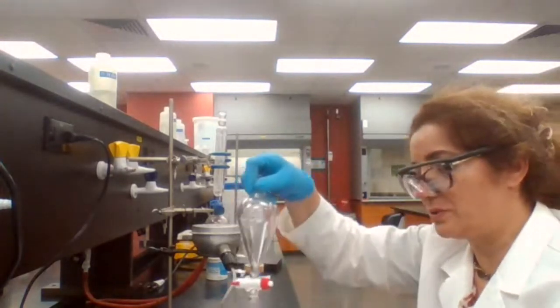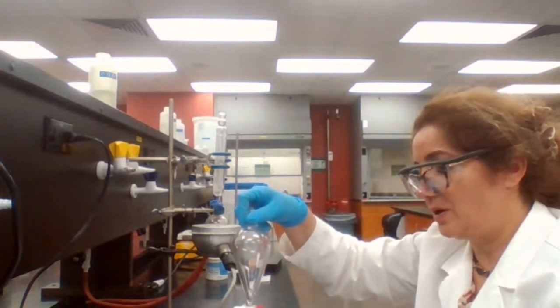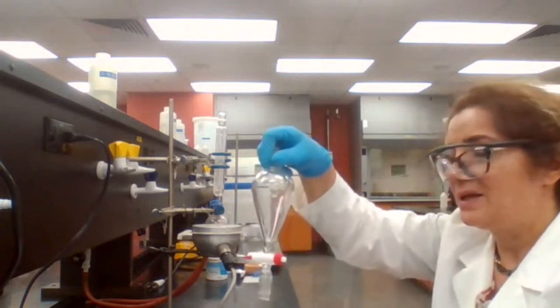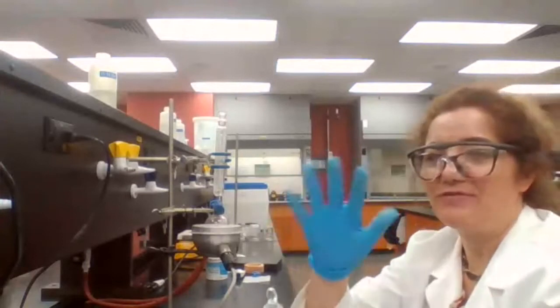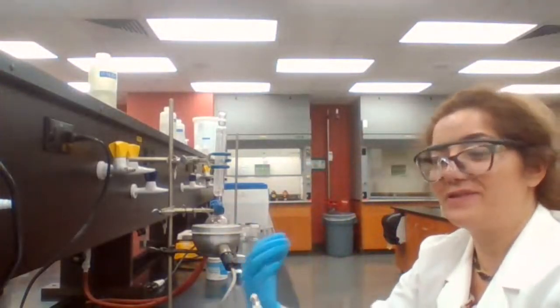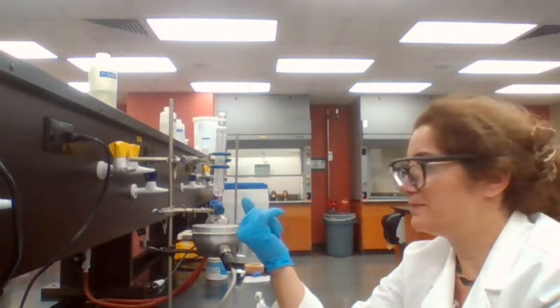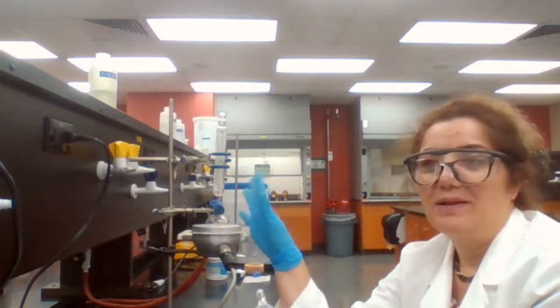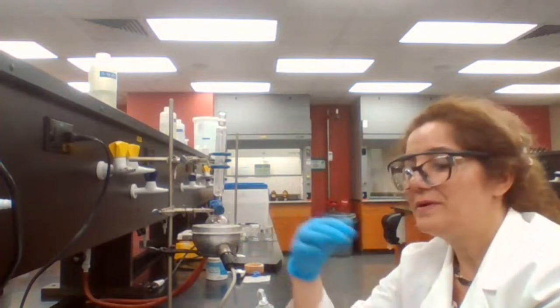You are going to wash with water, you are going to wash with sodium bicarbonate, you are going to wash with sodium chloride, and each time, the rule is, I think I told you, 5-5-5 for the recrystallization. When you have a solid product, you get your sample 5 minutes in ice, 5 minutes in vacuum, run the vacuum, and then 5 minutes in the oven.